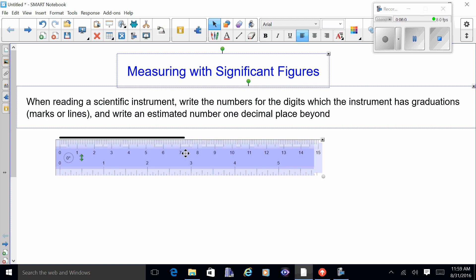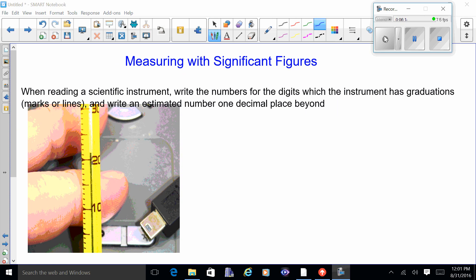Here is the thermometer. There are ten lines between the 10 and the 20, so every line is worth one degree. The mercury looks slightly above the 21 line — the big lines are the tens digit and the small lines in between are the ones digit. I know it's at 21, but I have to estimate the last digit. Since it's slightly above I'm going to say twenty-one point two degrees Celsius.